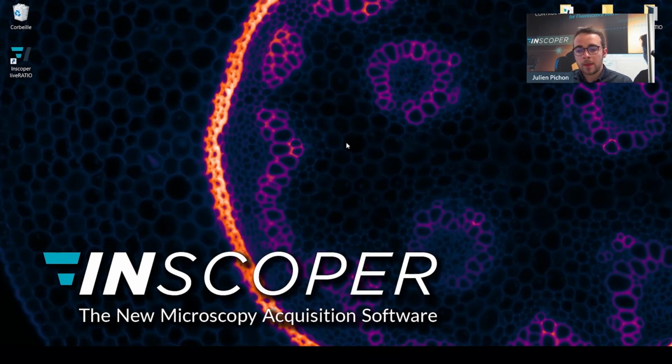To have access to such cells, we collaborated with an academic microscopy facility core in Nantes, in the west of France. We installed the INSCOPER liveRATIO on the Leica video microscope and integrated the new light source of coolLED. All experiments were recorded some weeks ago, and I'll present to you today the results we had.